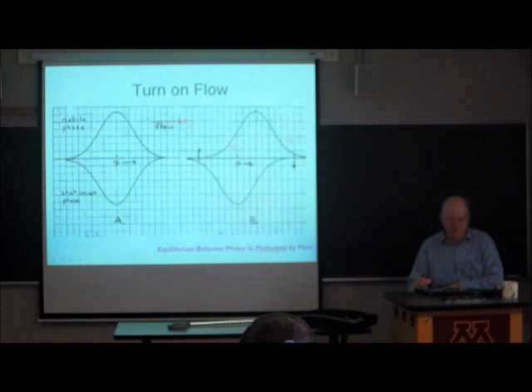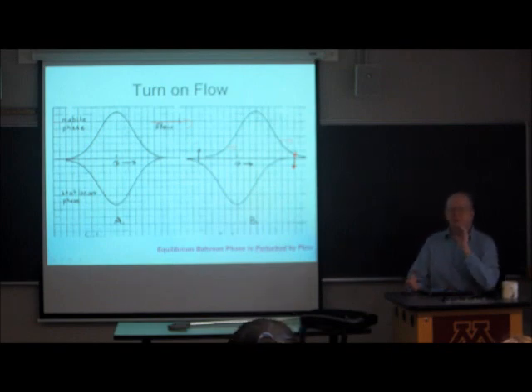But as soon as the front of the peak gets downstream a little bit, the molecules in the mobile phase are going to see that there's no molecules where at equilibrium there ought to be molecules in the stationary phase. So these guys up here in the mobile phase are going to move by diffusion down into the stationary phase and attempt to reach equilibrium.